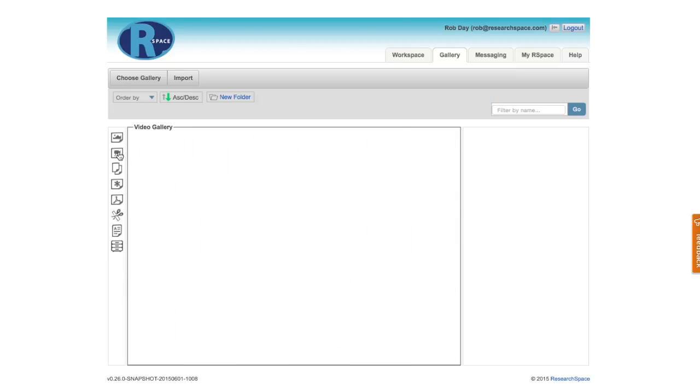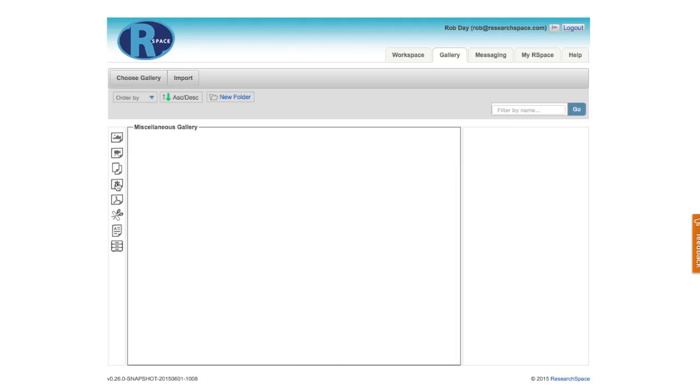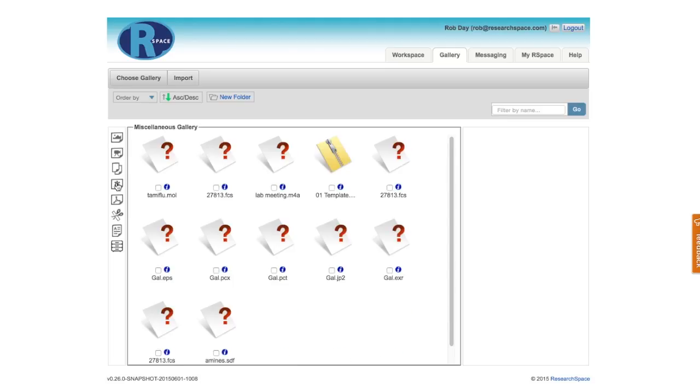There are also areas for multimedia files, for MS Office documents, PDFs and text files, and for files with miscellaneous extension names that the system might not recognize.